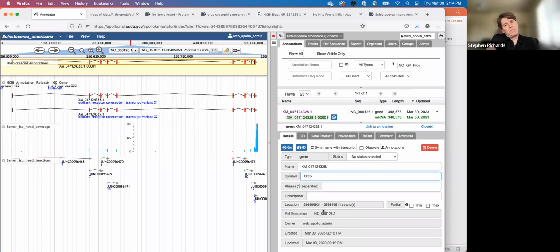So despite the fact that that would be a legitimate use, do we want to do that? I ask because we could make a policy that if we only find a few things we want to change and update, we're not going to bother. And if someone wants to put that in the supplementary data of a figure, then that's fine. We could make another policy where we said for educational purposes, we're not going to make any changes to NCBI at all. And that would make your life easier.